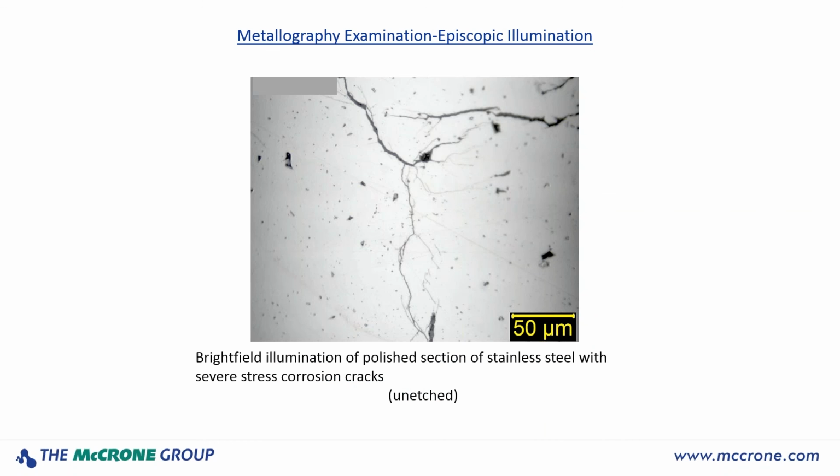Here's a bright field examination of a polished cross-section of stainless steel that has very severe stress corrosion cracks. This river-like pattern that you see in there is quite typical of stress corrosion cracking. And this is unetched. We don't want to see the grain structure so much. We're more interested now in actually seeing the corrosion cracks rather than the grain structure of the metal.